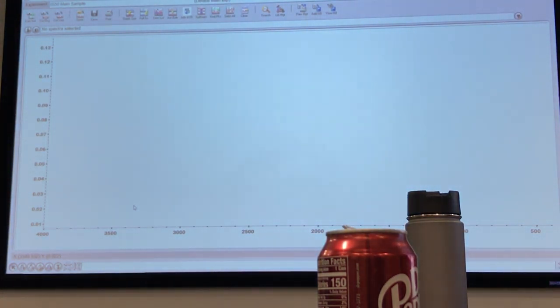Like, if your PVC weathers for 50 years, is it going to look exactly the same as if it is weathered for 5 years or maybe a year? Most likely not, right? But can you say this is PVC? Yes, that you can say. But why those smaller differences are in there, and whether the match scores are going to be perfect, like grade 90, 95, no. You won't reach there.